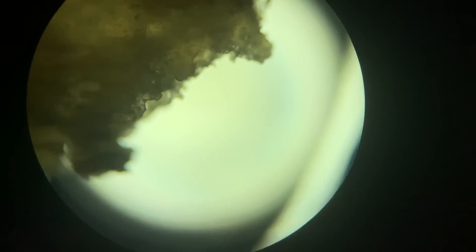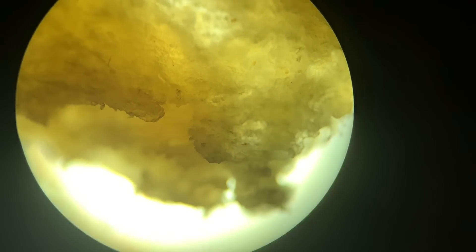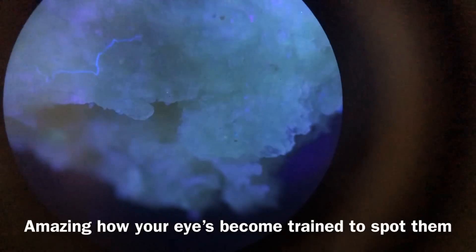Shocking. Well, I don't know what that looks like — it doesn't really look like chicken. I need to move it. That's a good shot now. If I can hold it... I think I saw a fiber there. I saw a fiber but it wasn't — oh shoot, I lost it. There we go — there's the fiber.